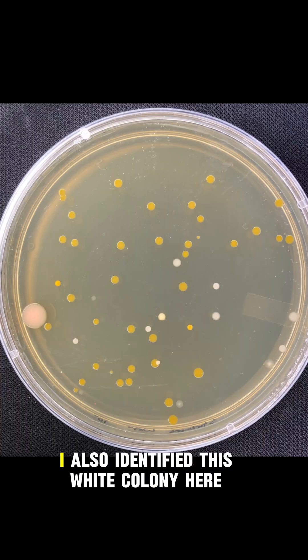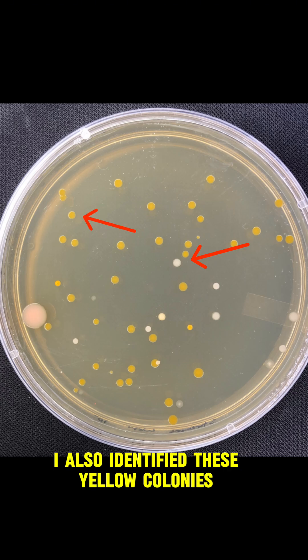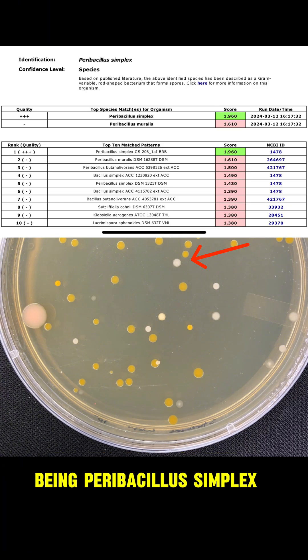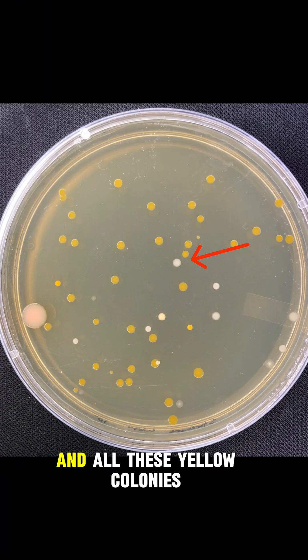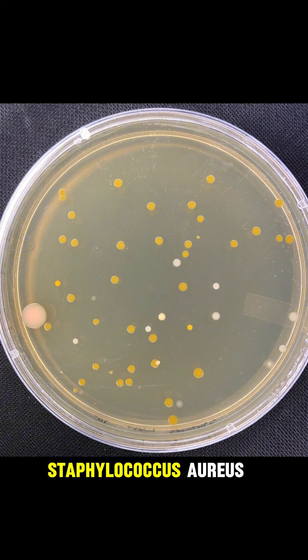On the water petri dish, I also identified this white colony because it looked different than the colonies found on the ice petri dish. Additionally, I identified these yellow colonies. The white colony ended up being Peribacillus simplex, and all these yellow colonies were identified as the very popular Staphylococcus aureus.